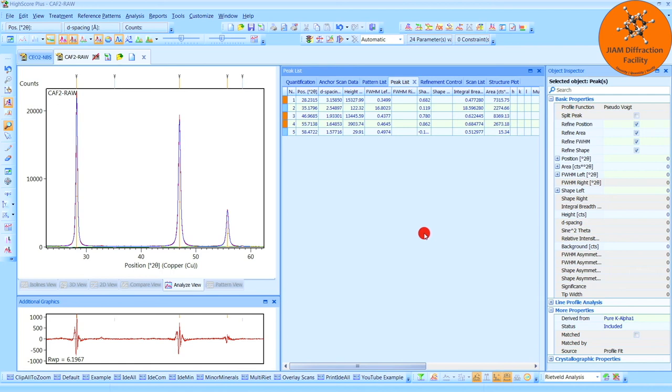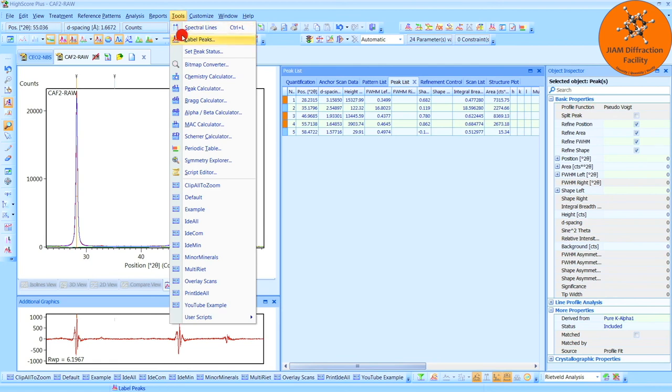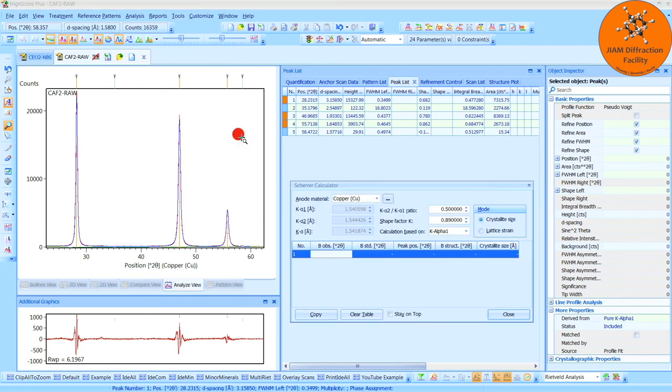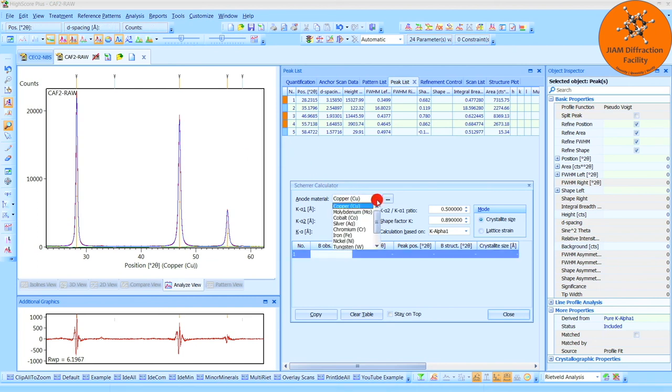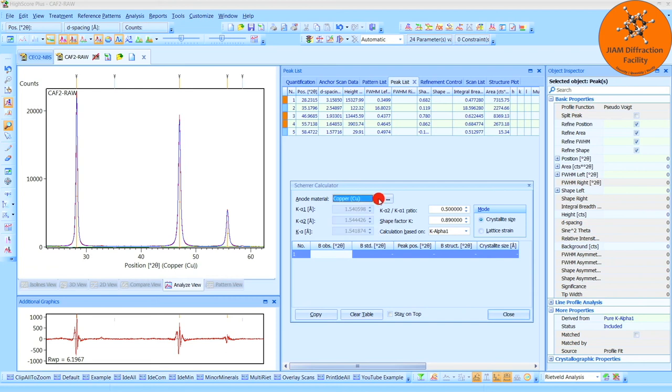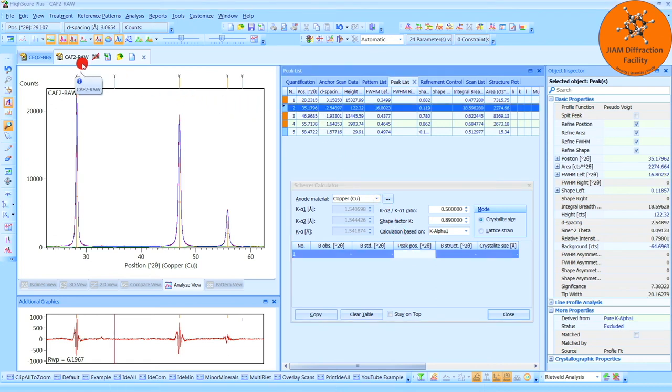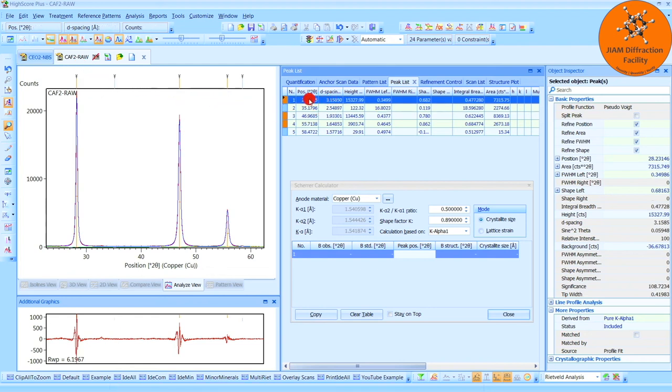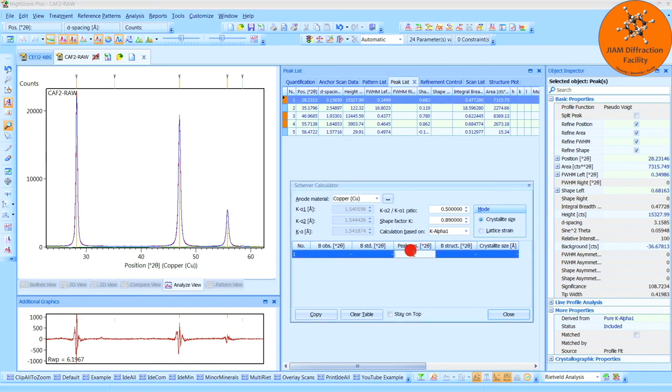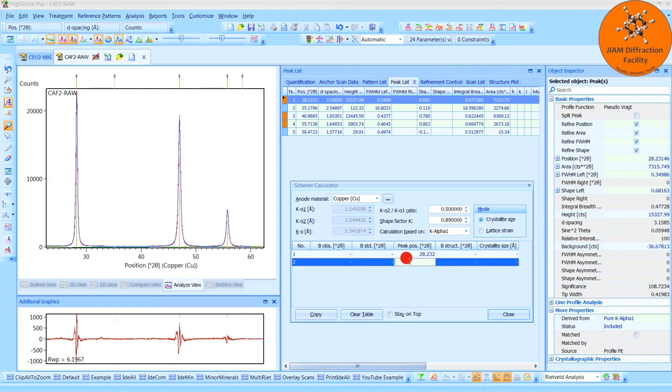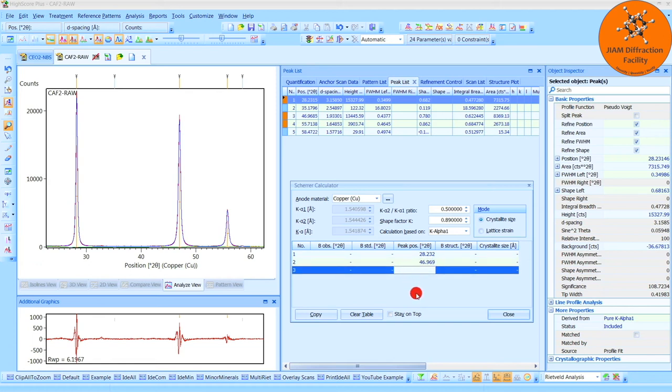For the Scherrer analysis, we can simply go to Tools, and choose Scherrer Calculator. Here, for the anode material, you will want to choose whichever anode you used for your experiment, copper, molybdenum, cobalt, whatever it is that you have. This experiment used copper, so I will keep that. The shape factor I will talk to you about in a moment, but I like to start with the Peak Position column. And this is the peak position of the peak that you want to analyze from your sample of interest. So in this example, fluorite. So that we will get from this column, and I will fill that in for each of these three peaks. So the first peak is 28.232. Next, we have 46.969. And then 55.714.